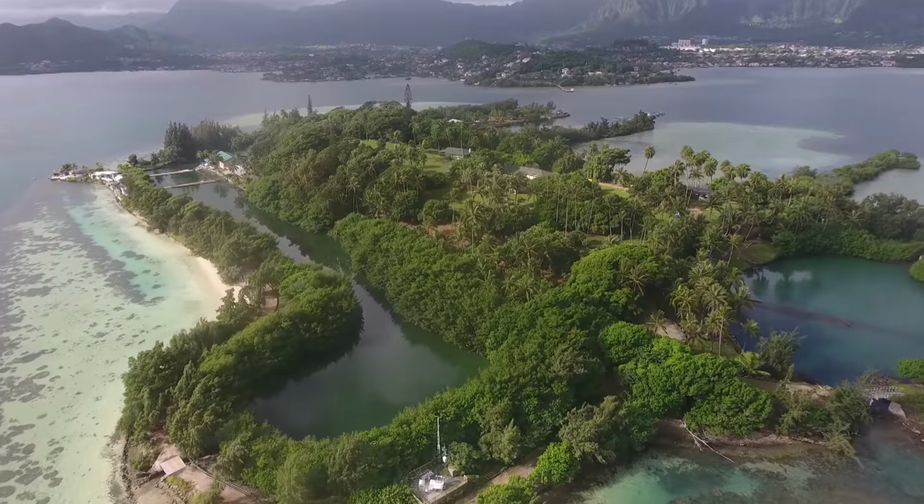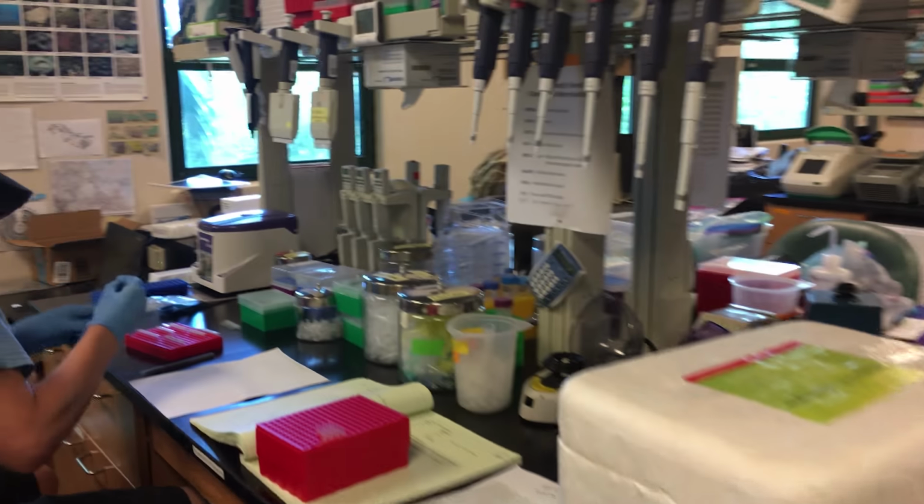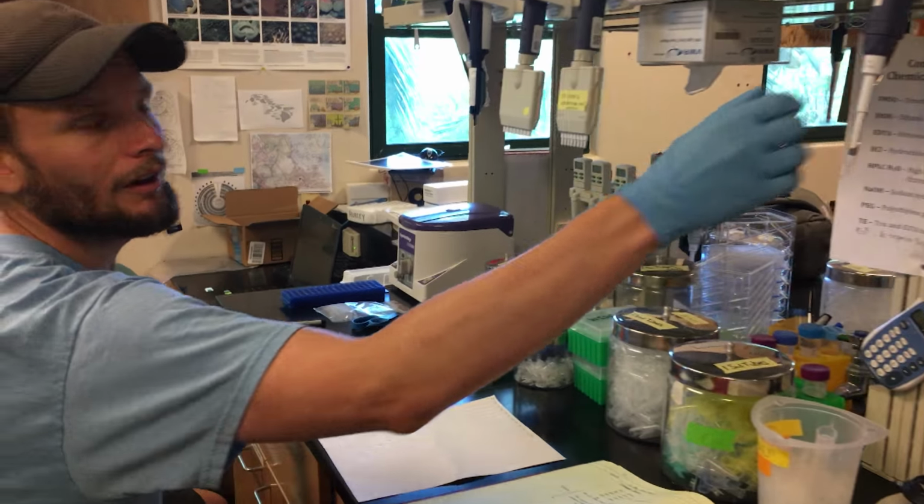HIMB, Hoku'oloi Coconut Island, is unique. There's nowhere else on the planet that you have this modern molecular facility with the ability to do the types of work that we do right here beside a live coral reef. We can actually work with live coral right here, and we can do those experiments, not have this baseline stress that's associated with transporting things, where you have to slosh them back and forth in a bucket for half a day.